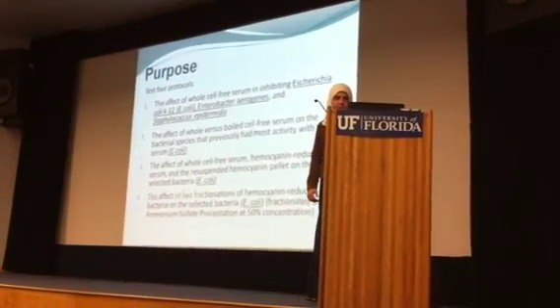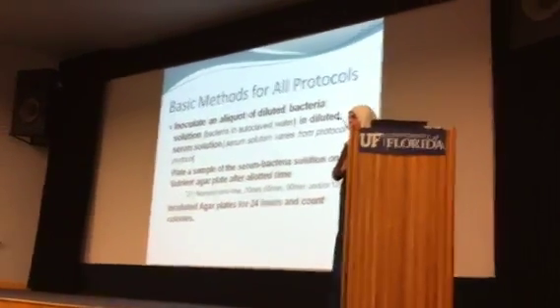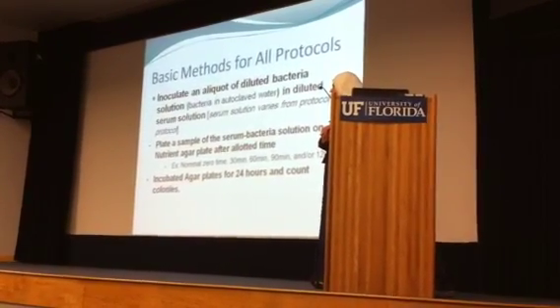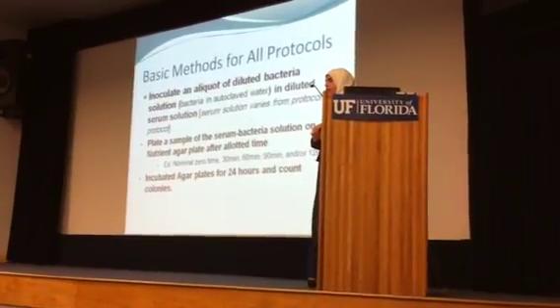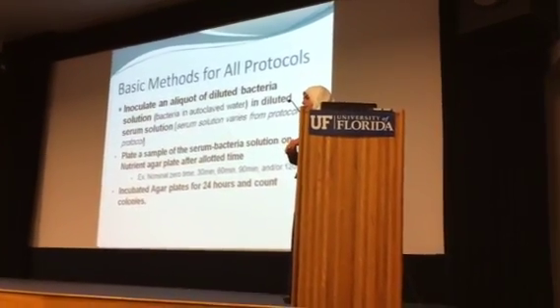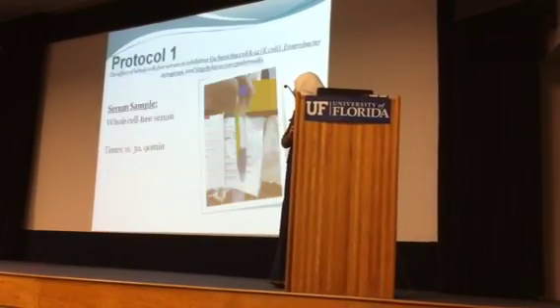different protein solutions. So my basic methods were to inoculate an aliquot of bacterial solution, which was bacteria inoculated in autoclaved water, and add that to serum samples that I would be using between protocols. And after the allotted time, which was normally a nominal time 0 and anywhere between 30 to 120 minutes, I would place that on nutrient agar and incubate that for 24 hours in an incubator and count the colonies.